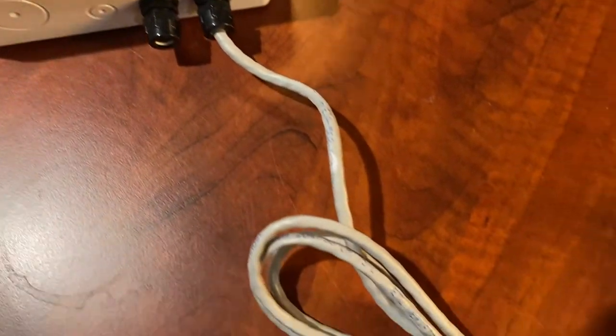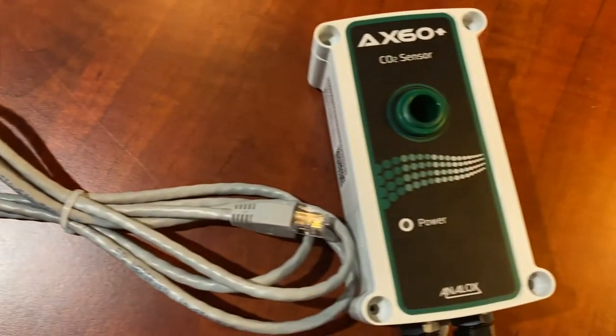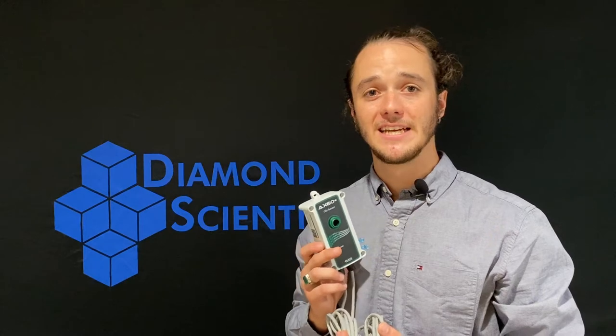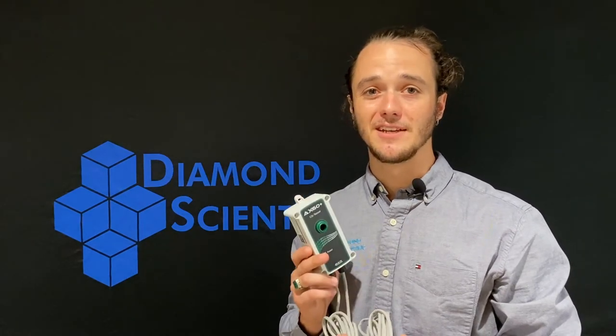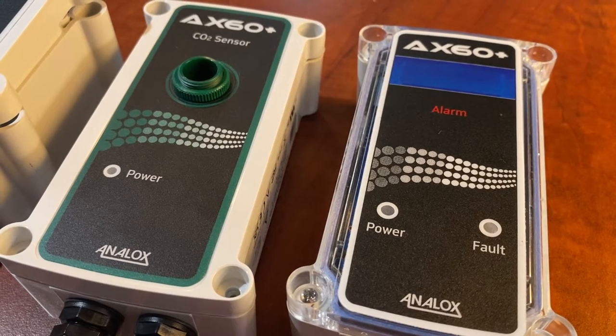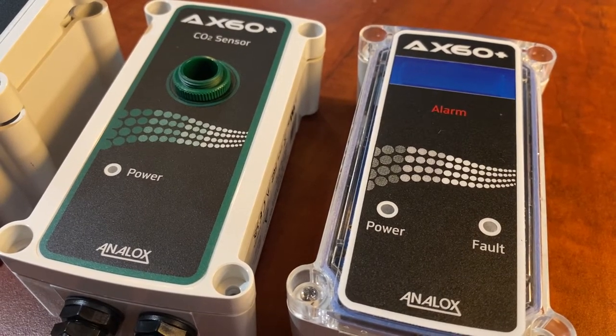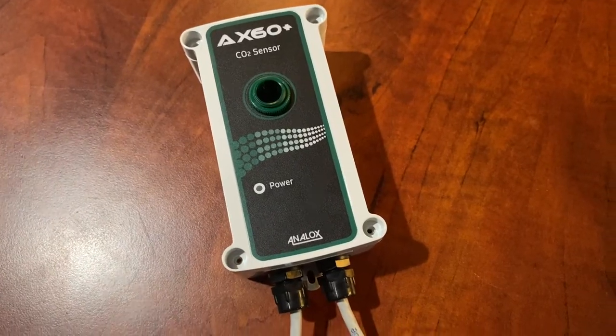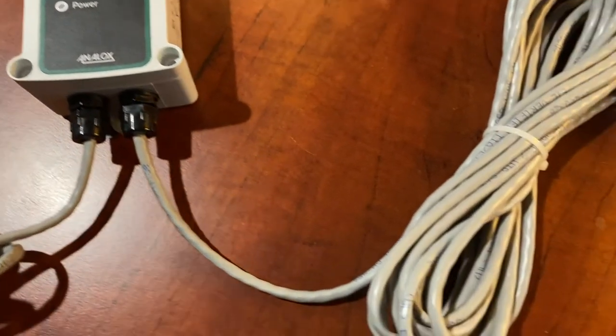The CAT5 cable is used to connect to the sensor. Our next component is the sensor itself. The AP1 package includes a single CO2 sensor, which is used in CO2-enriched environments. The CO2 sensor comes with two lengths of CAT5 cable, each five meters in length — one to connect back to the central display unit, and one to connect to the alarm.